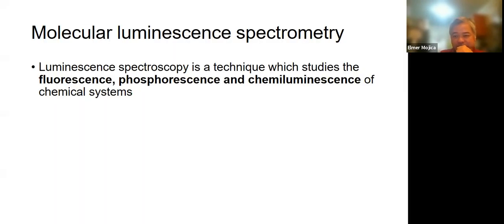So if you look at this, the overall topic that we have is what we call luminescence spectroscopy. And here we have fluorescence, phosphorescence, and chemiluminescence.